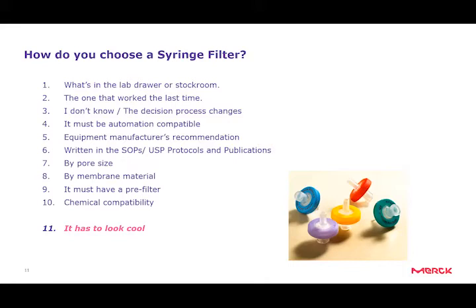And these factors rarely come into discussion when you directly ask customers about how they choose a syringe filter. Many times, or 80% of the times, the filter that was used for the previous sample or a previous type of material will work for your analysis. But when it doesn't work, then you do not know why it is not working, because it wasn't selected based on the key characteristics.